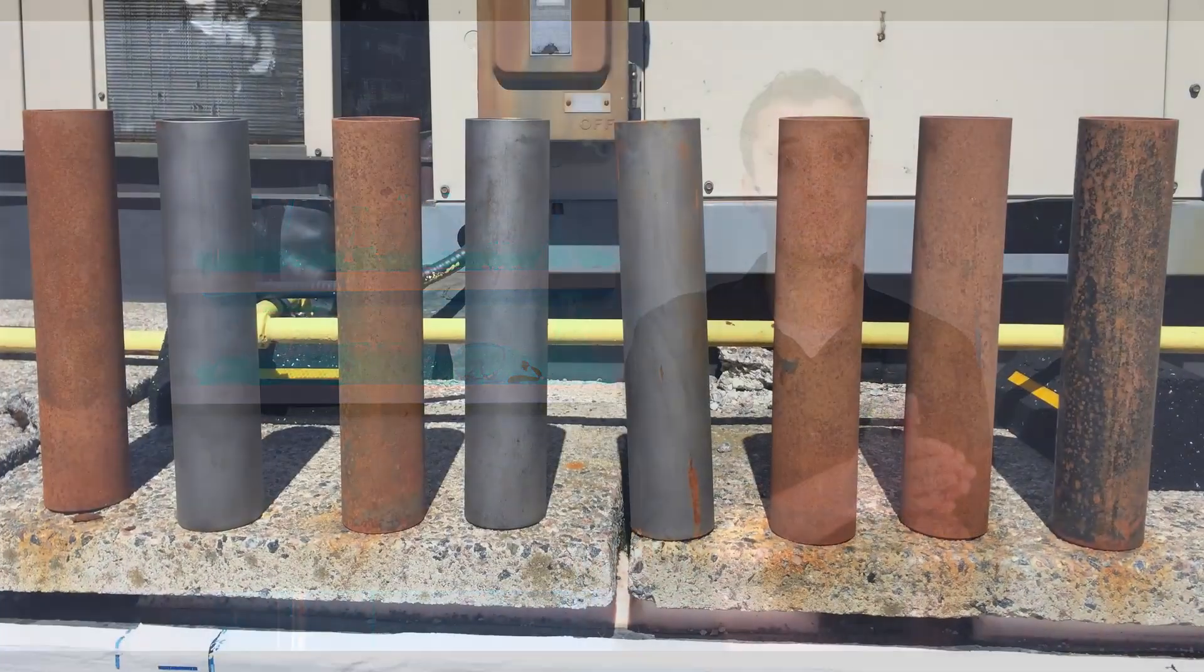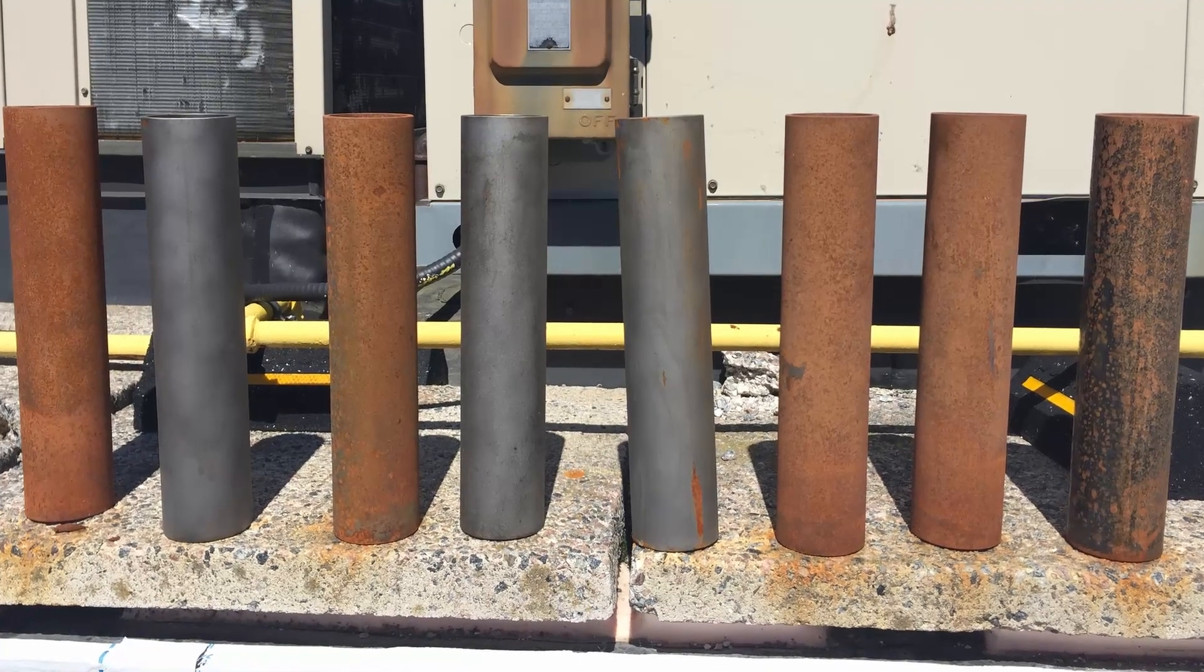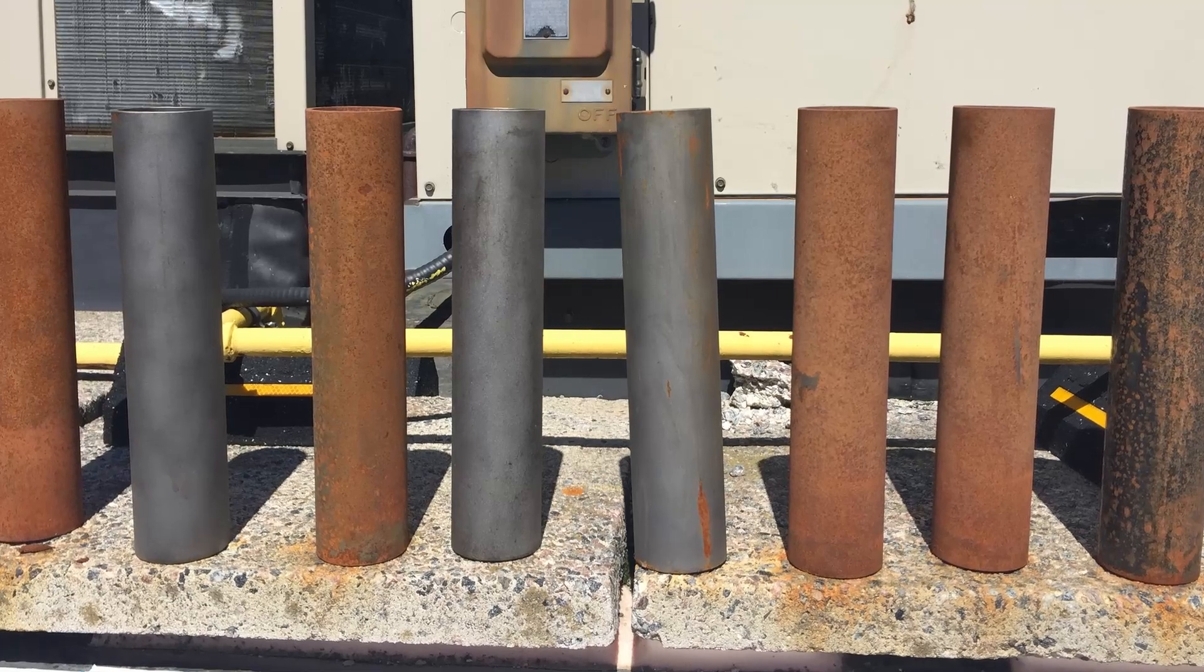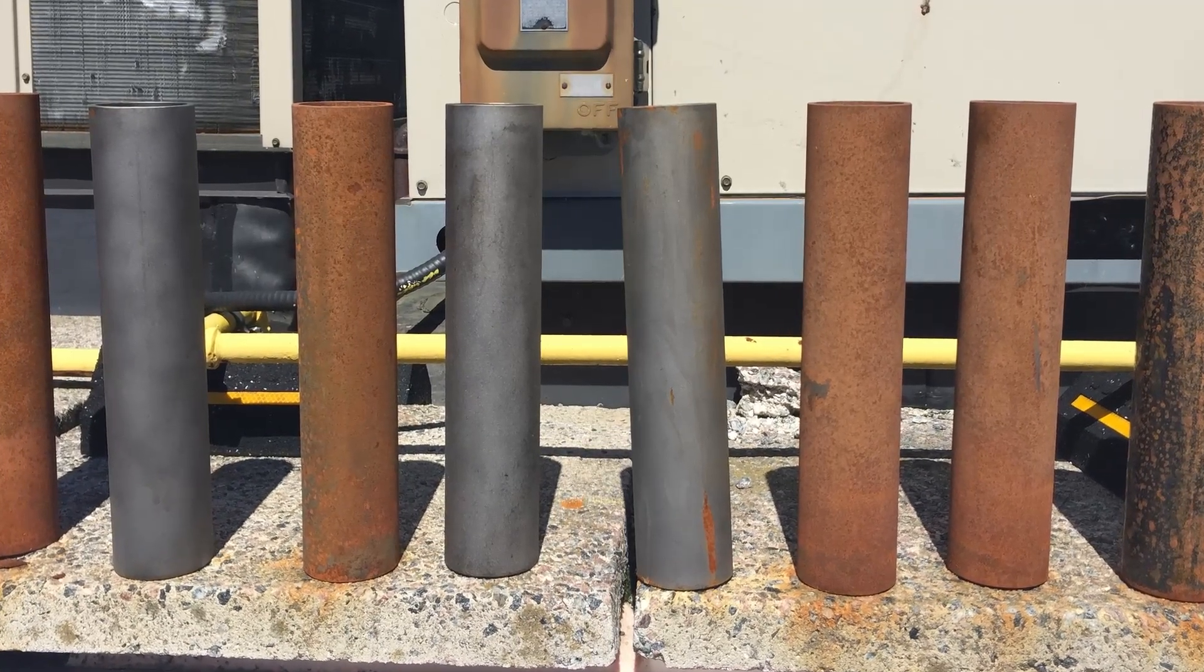Generally though, what they're doing is they're taking different pieces of metal and spraying different rust inhibitors on those pieces of metal, leaving them outside to face the elements, and then measuring how long those particular rust inhibitors last on the metal.